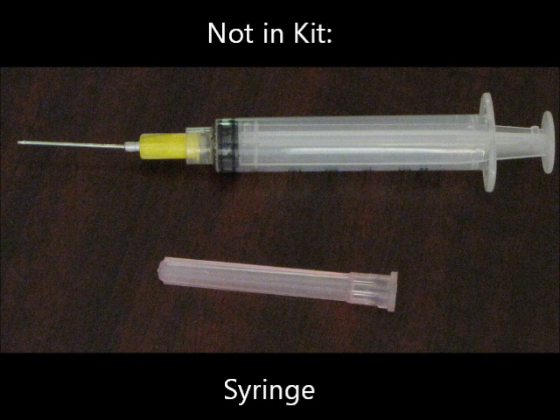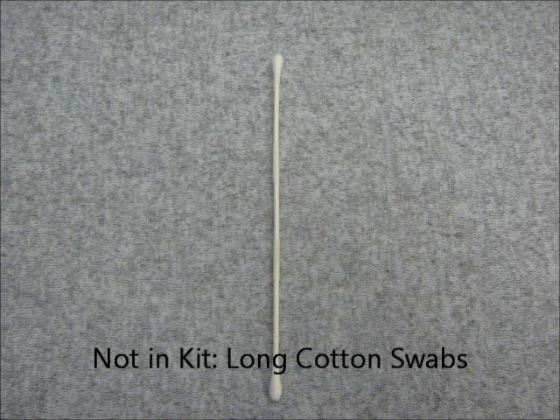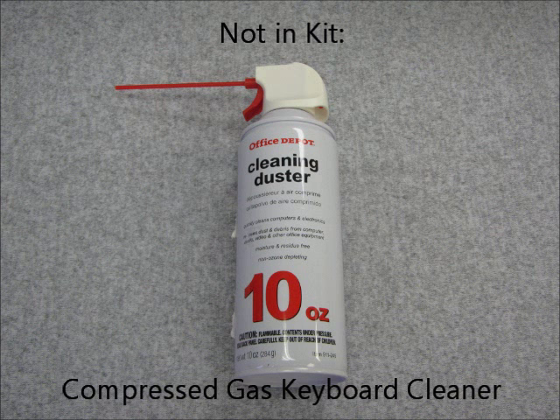Items not in the kit that are optional but you might find useful include a syringe to go with the blunt tip needle, a long cotton swab, and compressed gas keyboard cleaner.